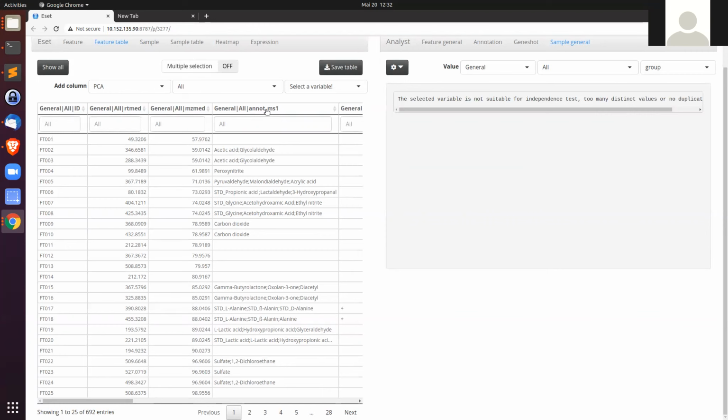So still, annotation in untargeted metabolomics is the bottleneck for data interpretation. The simplest way to annotate a metabolite is to match the mass we measured with the database. Of course, with some potential modifications or adducts already considered here. So for example, in this case, you can see the mass of the feature is 59 something, and this mass is the same as acetic acid in the database.